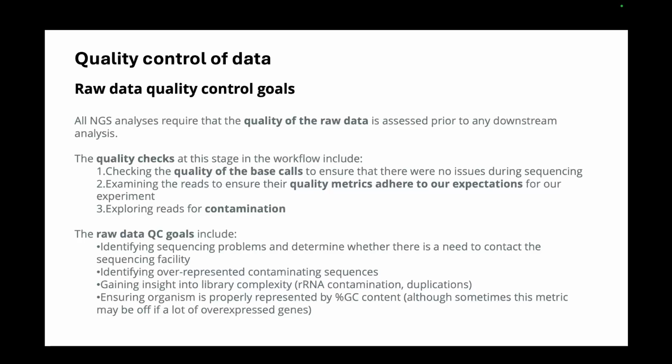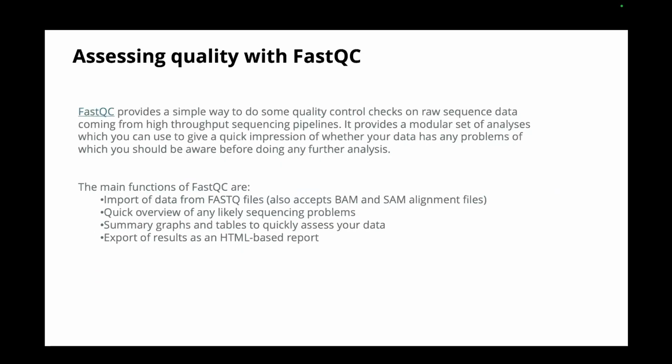It's the GC content: how much of your whole genome is just guanine and cytosine. It should ideally be around 50 to 60%, but sometimes it is very high or very low, which suggests you have some issue with your data. So this is another important metric that we check, to see if there is contamination or any data quality issues.